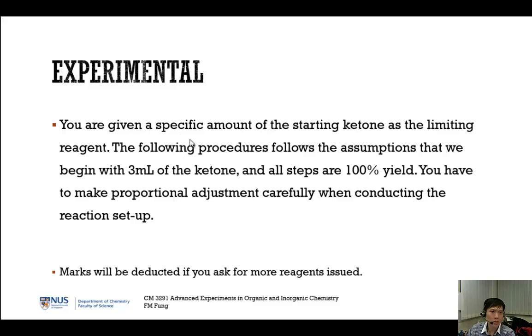Now coming to the experiments, once again I have to remind you about this specific amount, which we mentioned at the start of the lab. You are being limited by this ketone here, so marks will be deducted for sure if you ask for more of this ketone, because we really give you more than enough. And inside the lab manual, all the steps are assumed to be 100% yield.